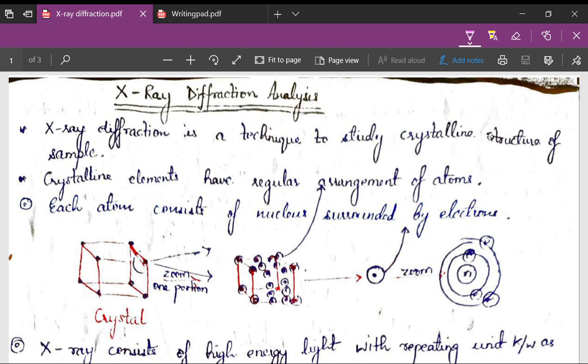In diffraction, when parallel waves of light are obstructed by a small object, that is corner, edge, sharp, slit, etc., then waves spread beyond the edge of obstruction and interfere, resulting in dark and light patterns. So now we should understand what is X-ray diffraction in a whole.